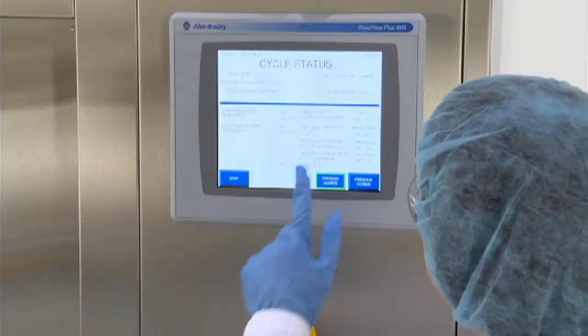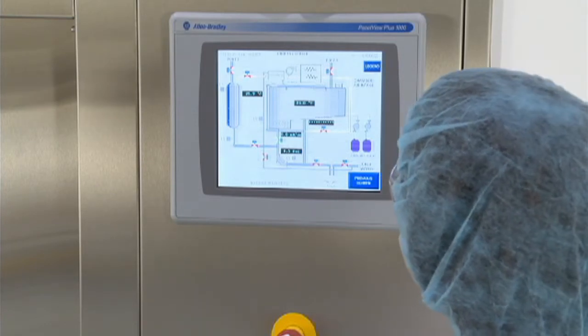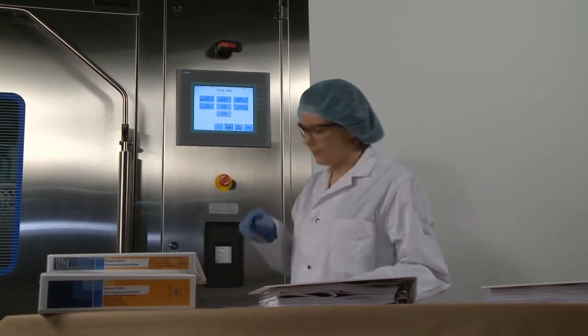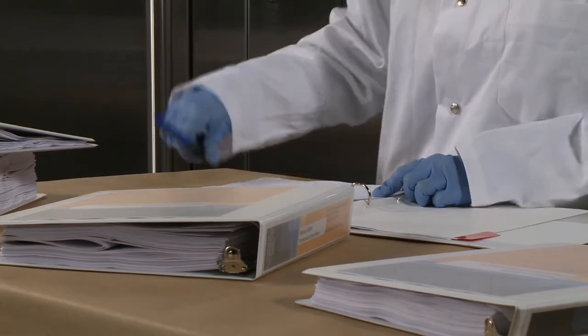The Steris PG series of washers were designed to constantly monitor all critical washing parameters, making validation easier. Process documentation can be recorded on an integrated printer or downloaded to an external computer. Complete design, manufacturing, and qualification documentation can be provided to facilitate and accelerate on-site qualifications.